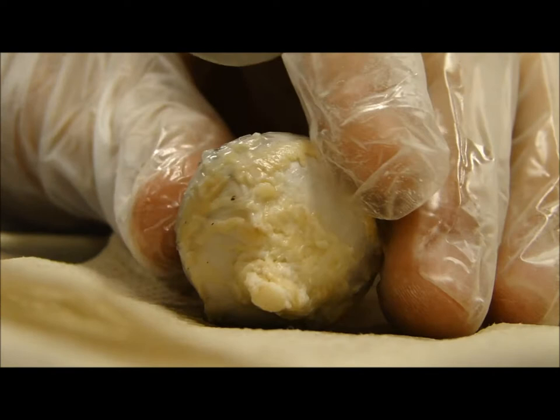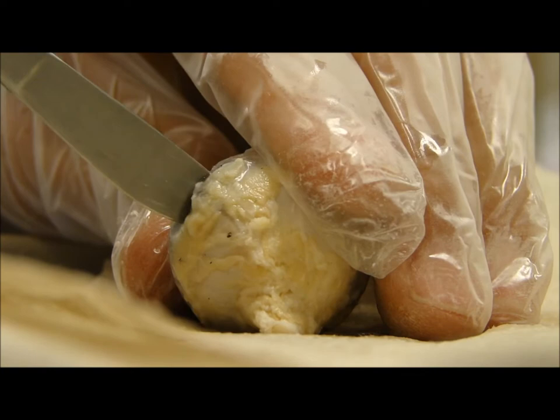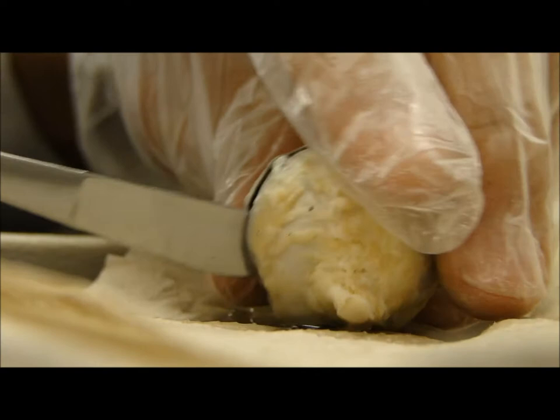Wait, how do you cut it? Just keep cutting it. Right here? Yeah, just cut it. Check if I'm recording. Oh my gosh. So much water.